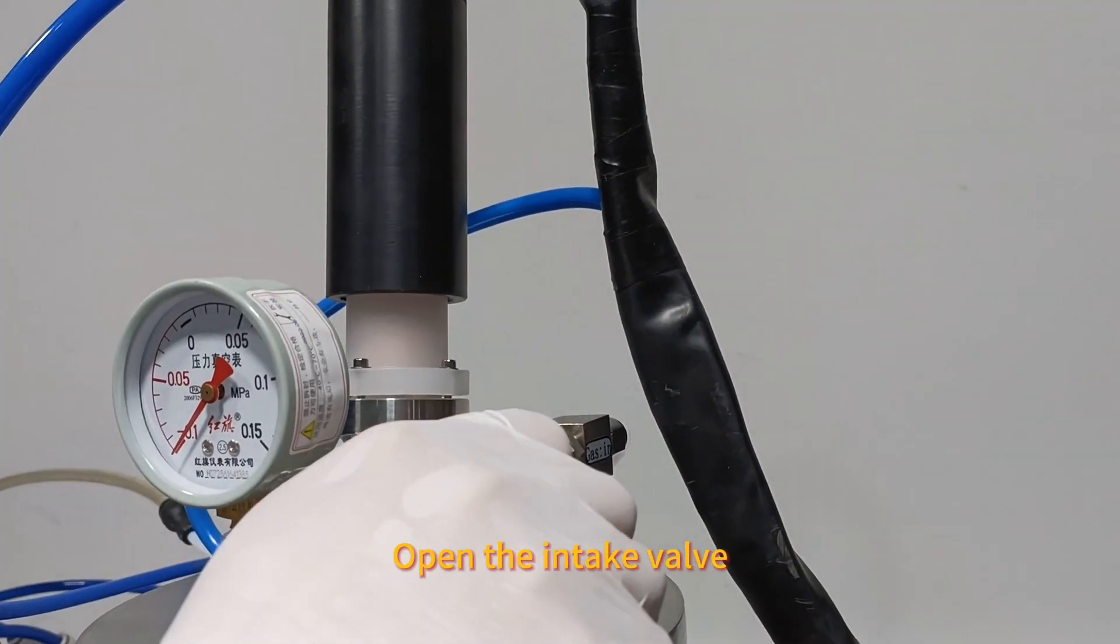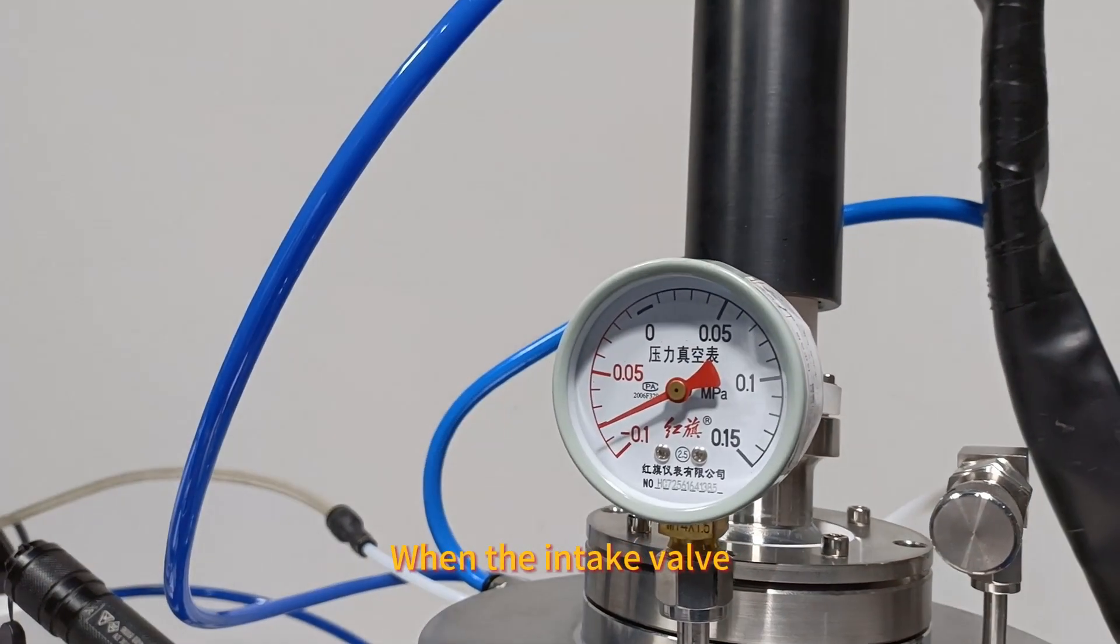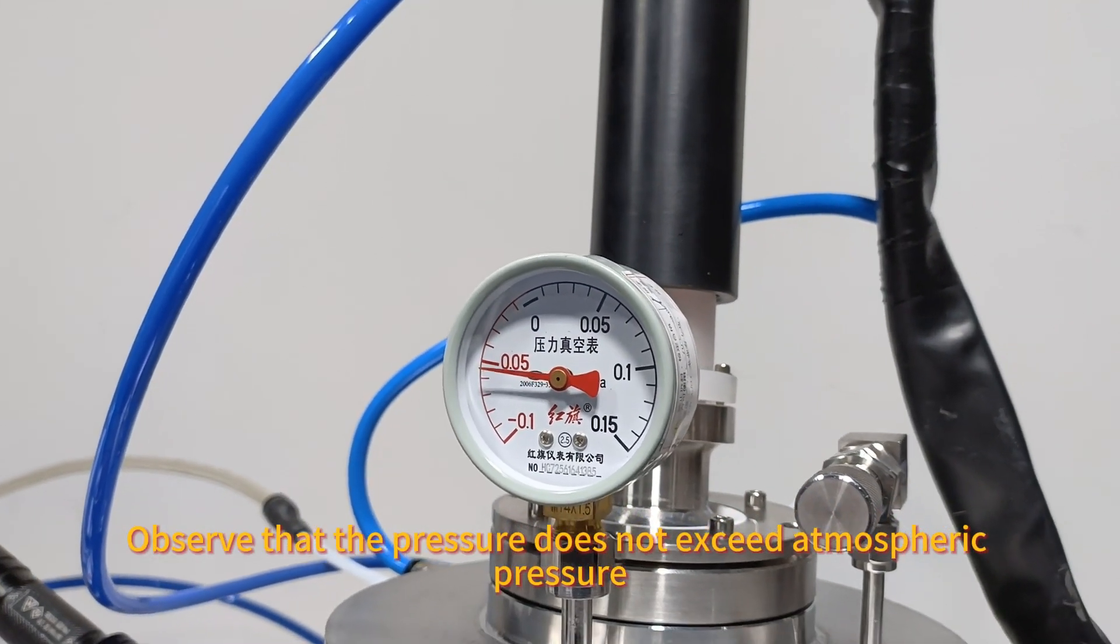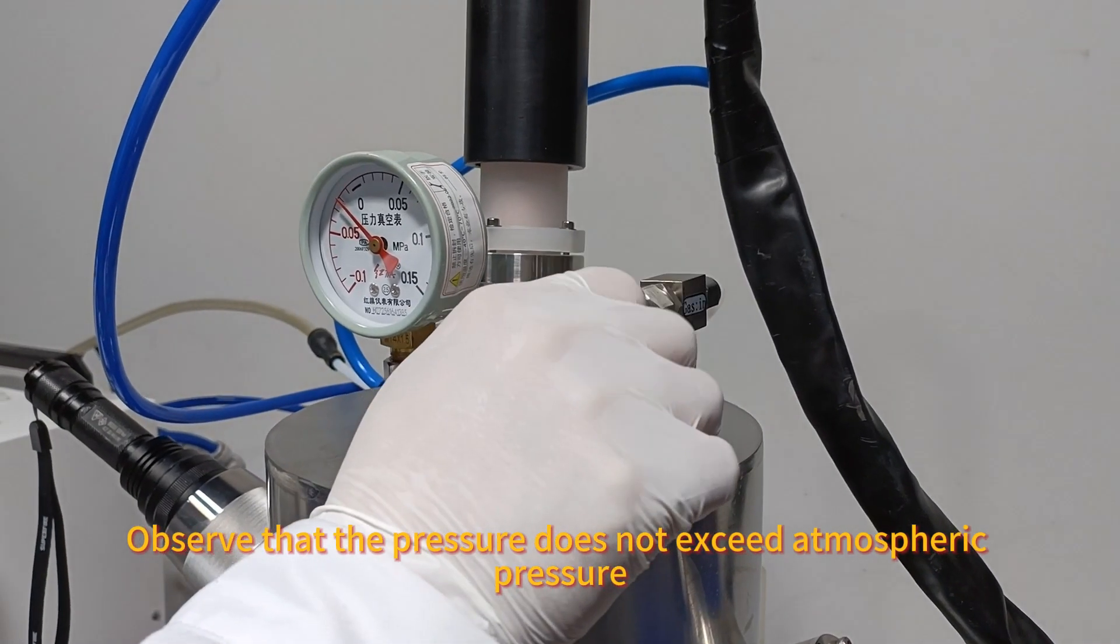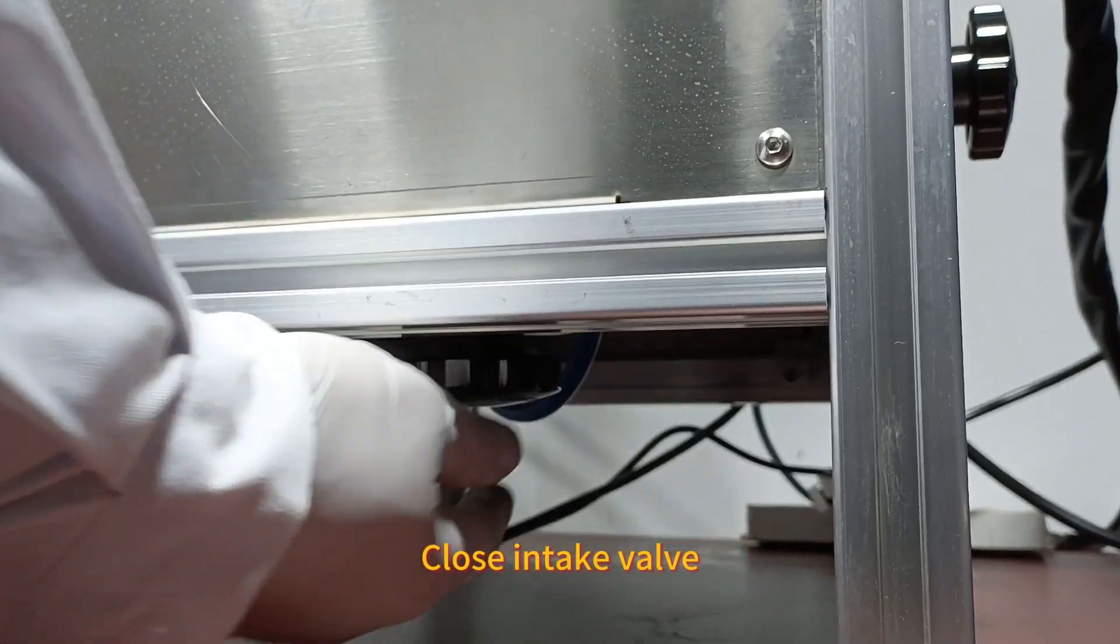Open the intake valve. Cleaning chamber. Open the exhaust valve when the intake valve is open. Observe that the pressure does not exceed atmospheric pressure. When close to atmospheric pressure, close intake valve.